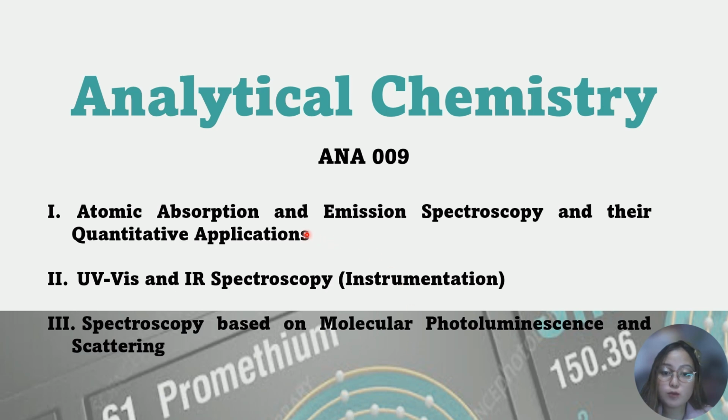To better understand the spectroscopic methods, this CRTV will include the following topics. First is the atomic absorption and emission spectroscopy and their quantitative applications. Second is UV-Vis and IR spectroscopy instrumentation. And lastly, spectroscopy based on molecular photoluminescence and scattering.